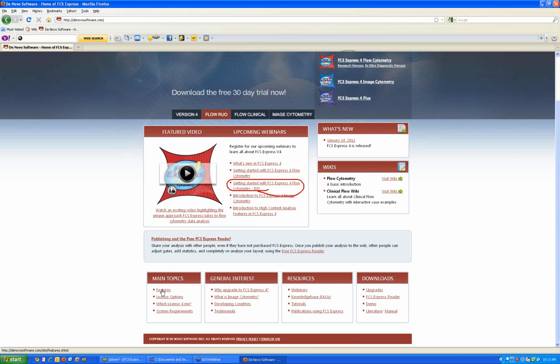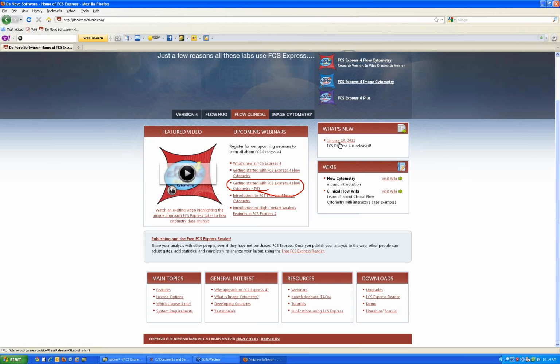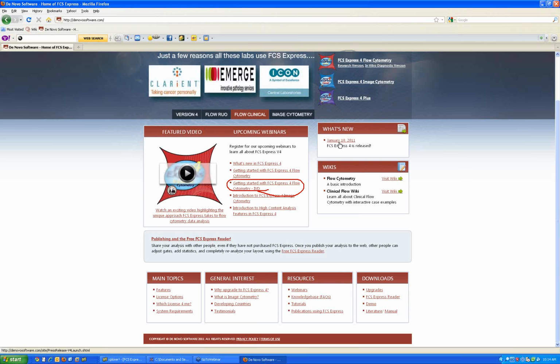Okay, so what are the general goals of FCS Express 4? We incorporated tons of feedback from users like yourselves. I think most people know that we're pretty responsive and really do value all of your input and really appreciate our customers and try to provide good support. And part of that is incorporating the suggestions that our customers have asked. So we had 3 main goals.